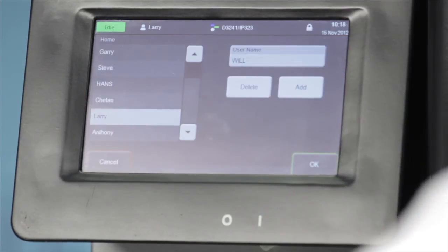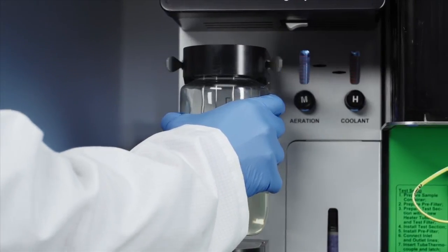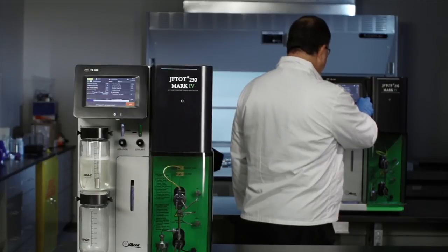The Jephtot 4 was designed to meet your toughest challenges. It's safer to use and easier to operate, and it increases the productivity in your lab while reducing your overall cost to operate.